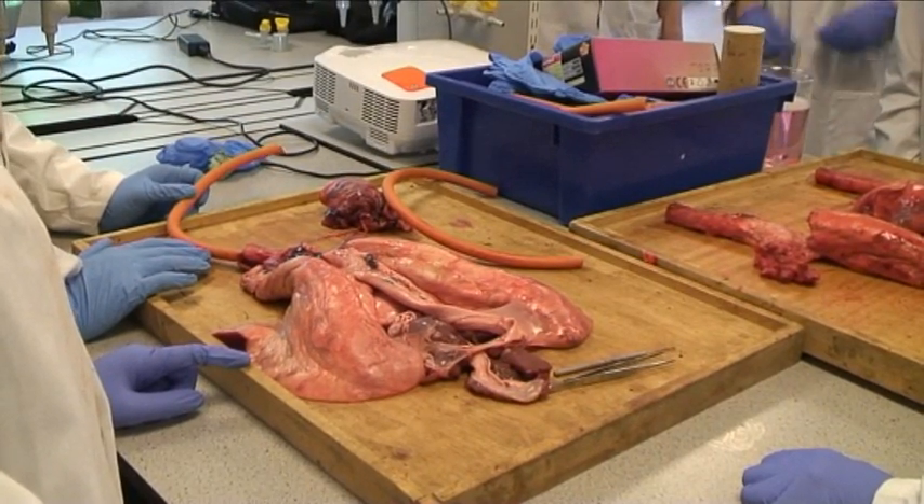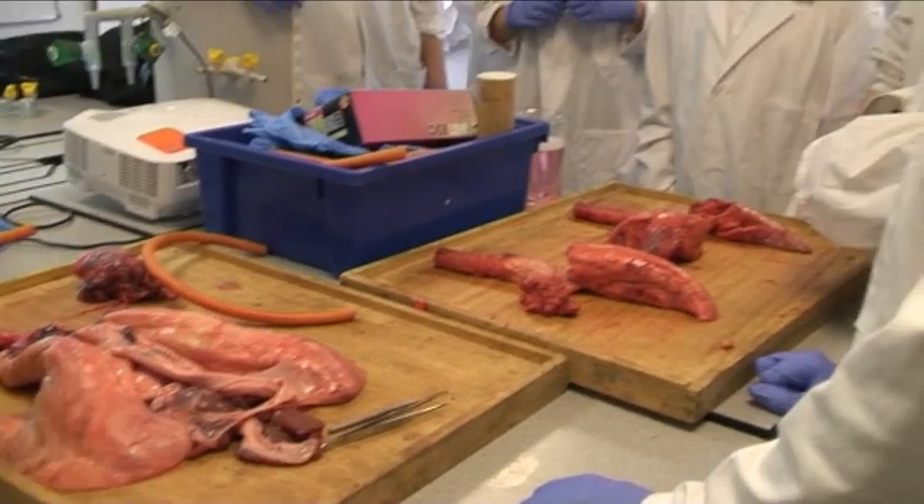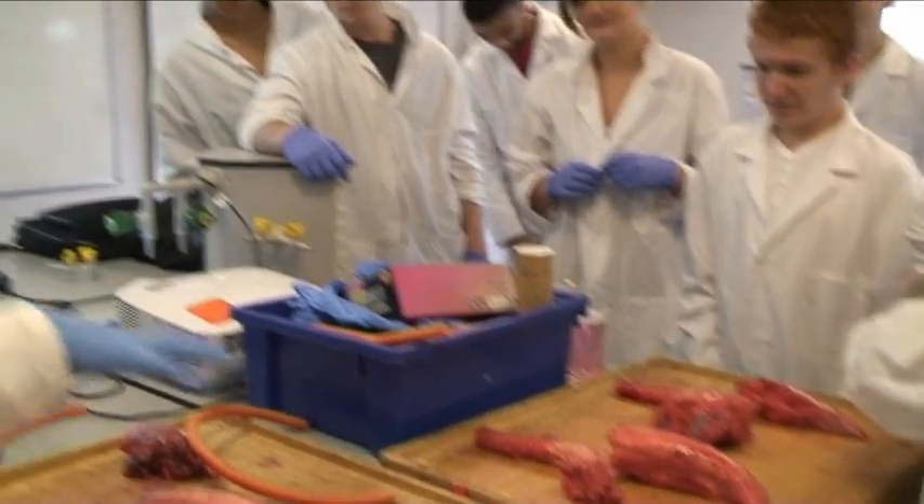Today's session, guys, we're looking at the respiratory system, the breathing system, and what we're doing — we're looking at lung dissection.